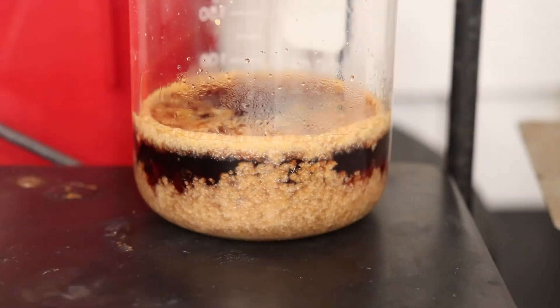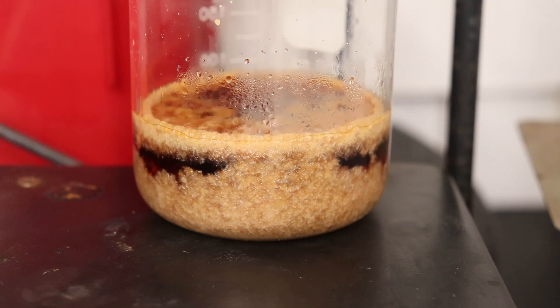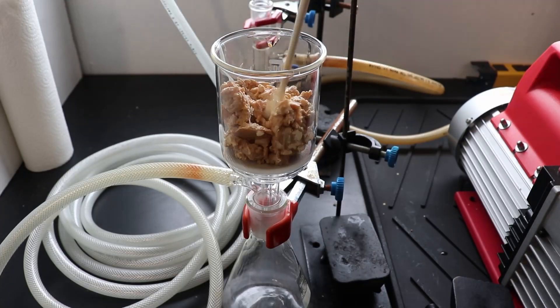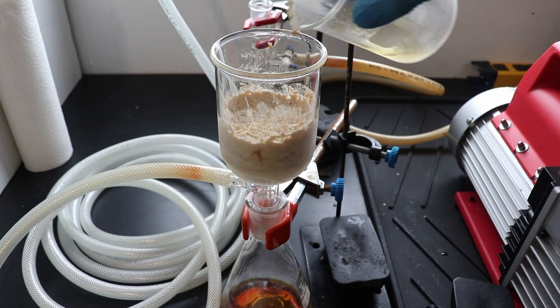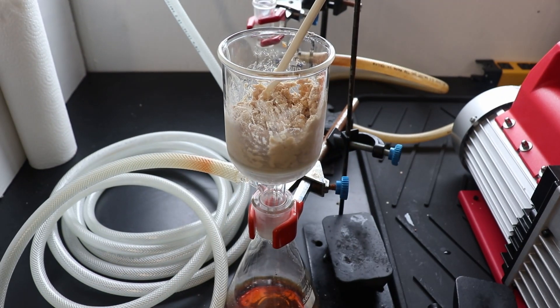Once everything had dissolved, I took the solution off the heat, allowing it to cool slowly to room temperature. I then placed it in the freezer for a few hours to fully crystallize, broke up the mass, and filtered it, then washed with a little ice-cold ethanol.